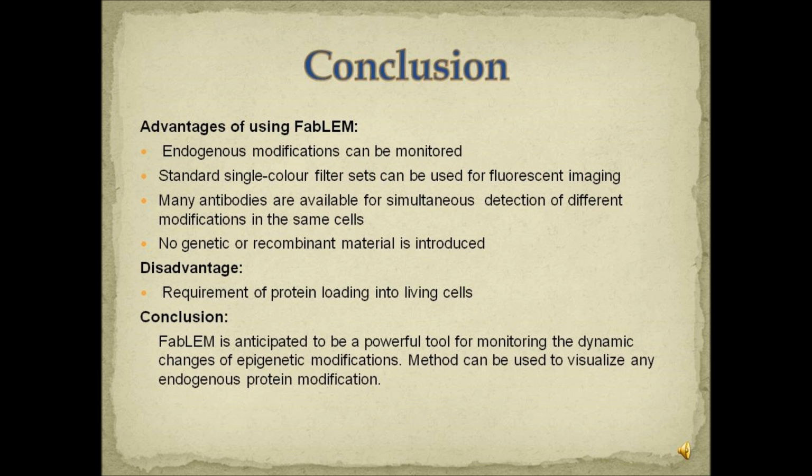In the future, many different and easier techniques may be developed which would make this method easier to carry out. In conclusion, it is expected that FabLEM will be a powerful tool for monitoring the dynamic changes of epigenetic modifications during the cell and developmental cycles, and in response to stimuli and small chemicals. The method can be used to visualize any endogenous protein modification, providing a novel strategy to understand the dynamic nature of cell regulation and testing the response of patient cells to potentially therapeutic drugs.